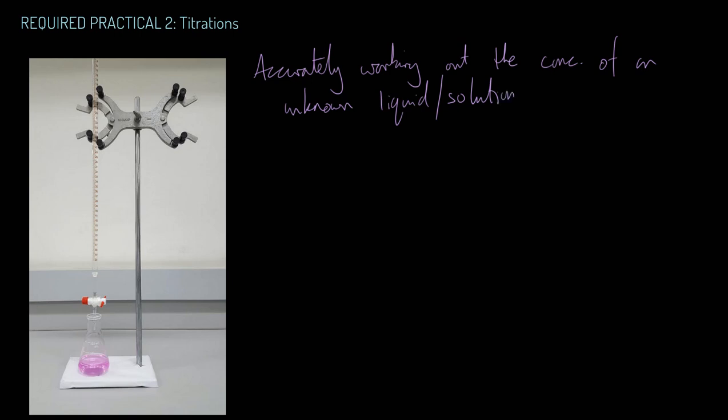So let's have a bit of a walk through the equipment. My unknown liquid in this case is in this flask at the bottom. So this here is an acid of unknown concentration, and I would like to find out how concentrated it is.